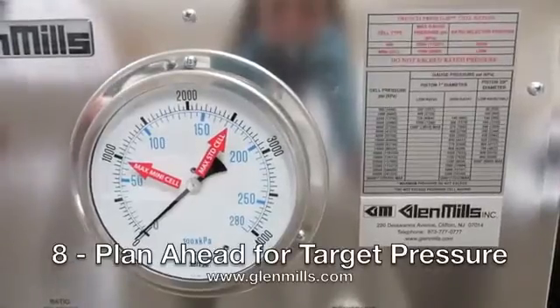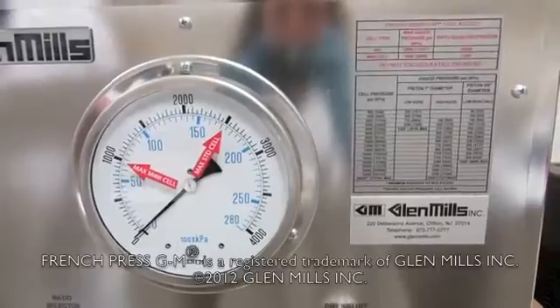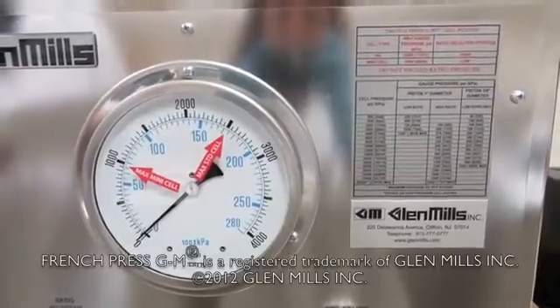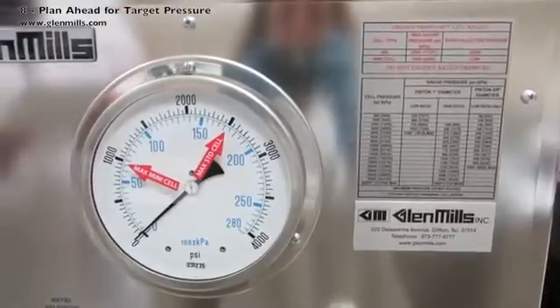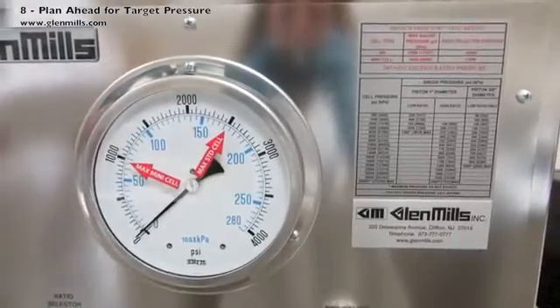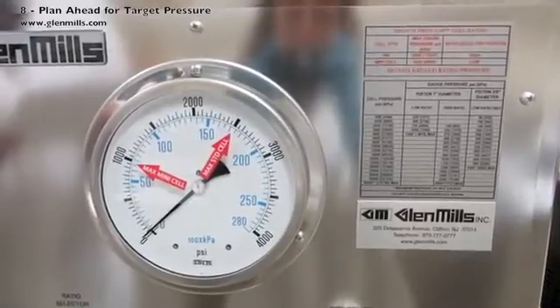Plan ahead for the target pressure needed. Note, the pressure reading on the gauge is not the actual pressure inside the standard pressure cell. A conversion table on the front of the equipment is used to determine the proper gauge pressure reading needed to attain the proper pressure on the biological cells inside the standard pressure cell.